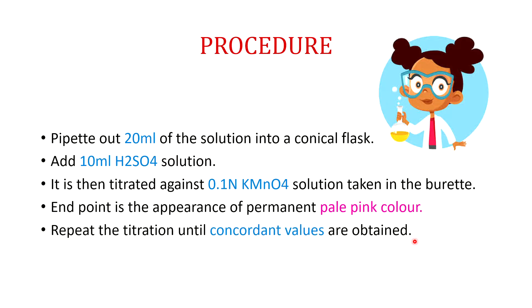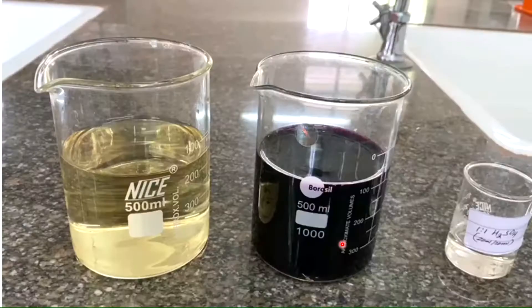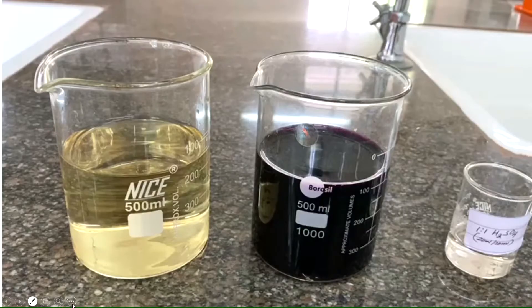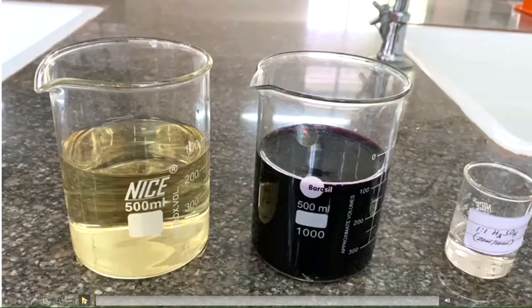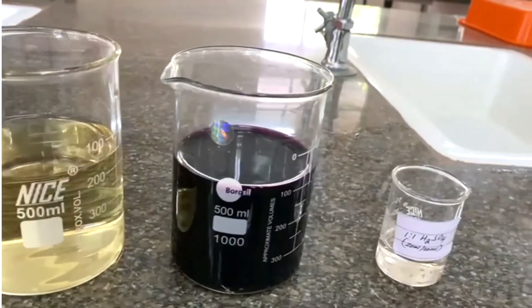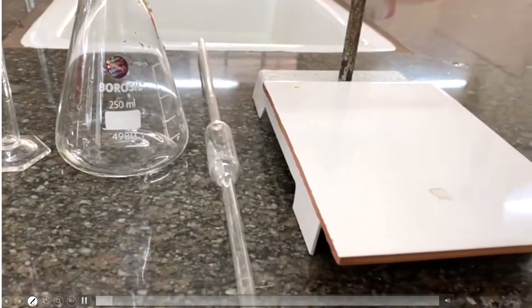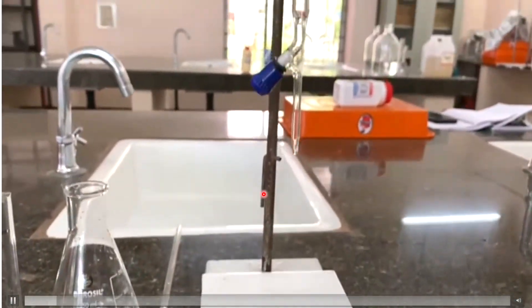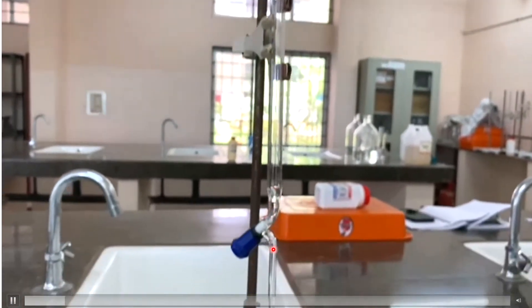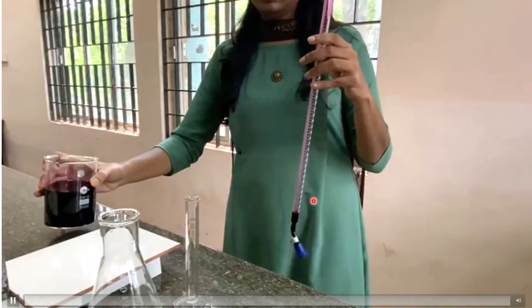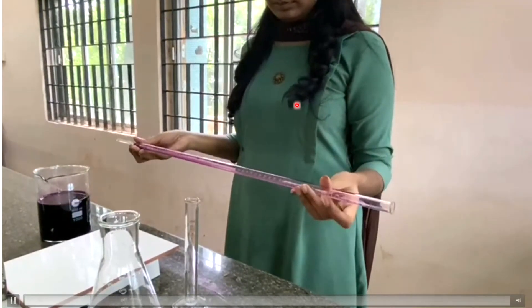We will record concordant values and repeat the titration. Then we set up the apparatus and do an initial experiment. We fill the burette with KMnO₄ solution.